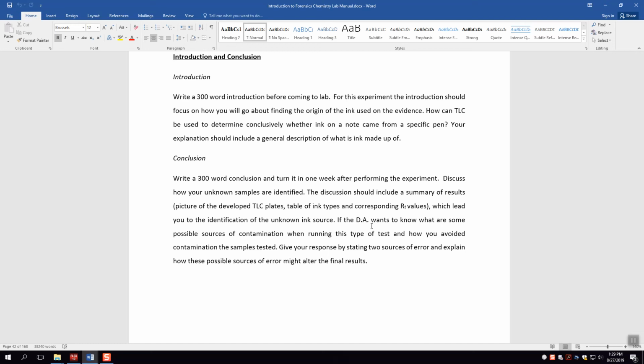So I think that we left a little bit of the theory out today on this video because we spent a lot of time on the theory of TLC on the previous video. So here is just a forensic application of TLC that kind of coincides with what you learned about TLC last time.